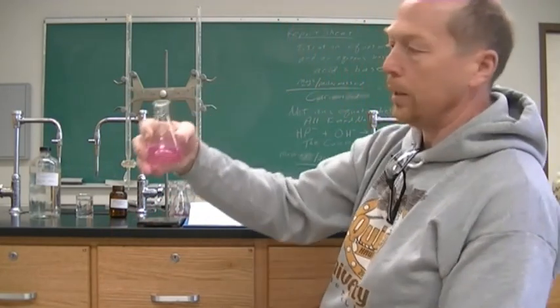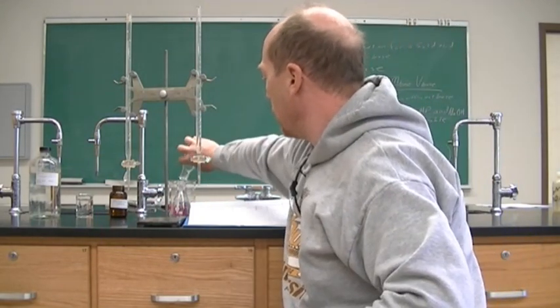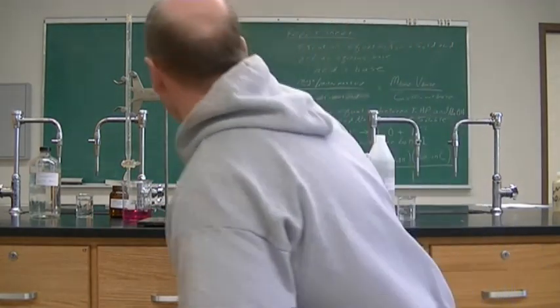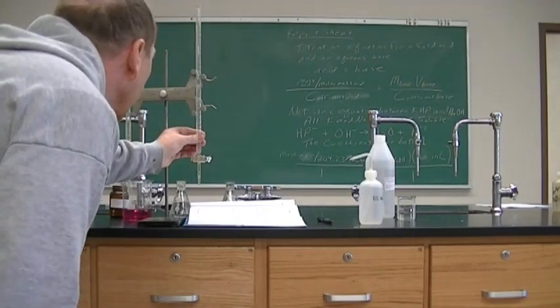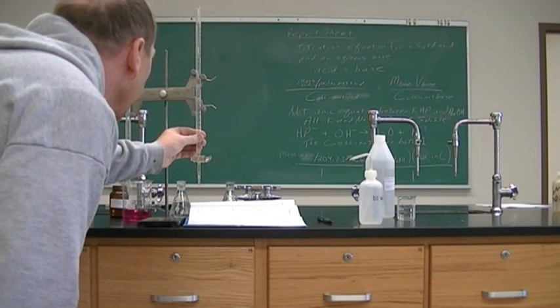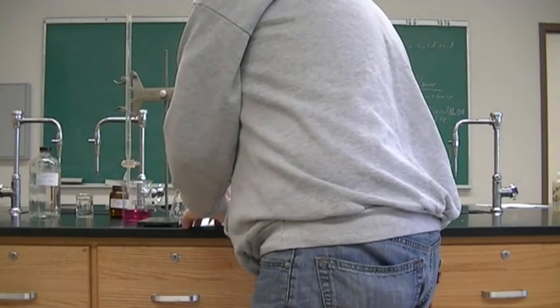All right, so it is a light pink. It stayed for 30 seconds. I'm pouring it into my beaker back here, the endpoint beaker. All right, and so now all we need is our final volume. And the final volume for this one is 11.59 milliliters.